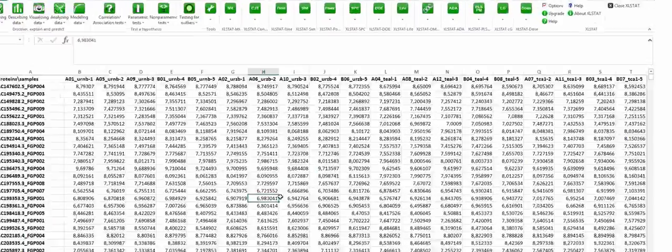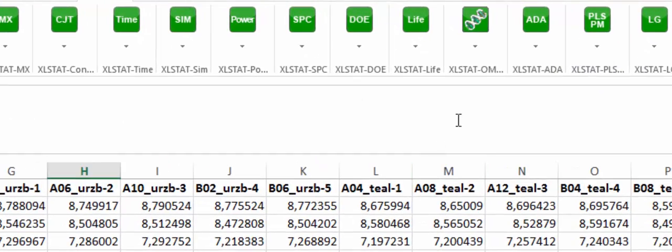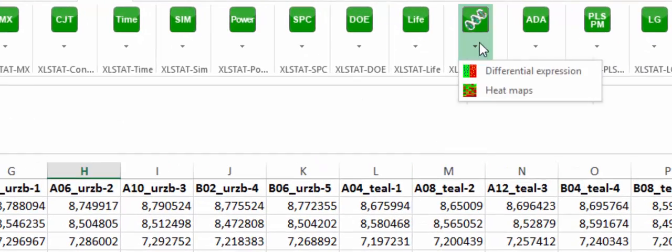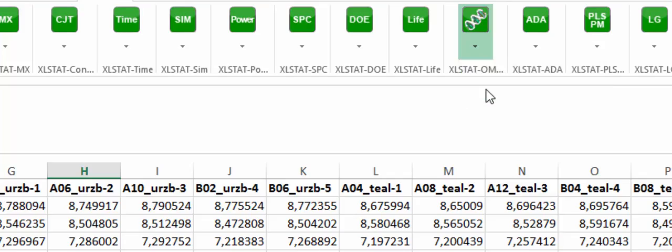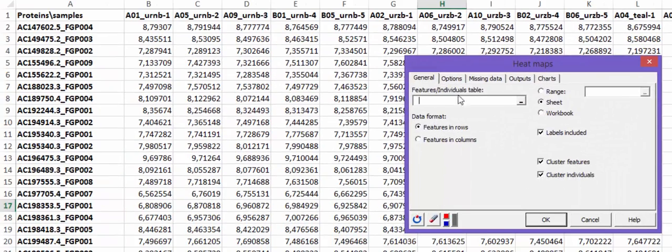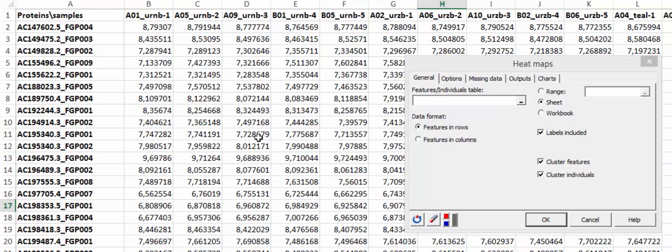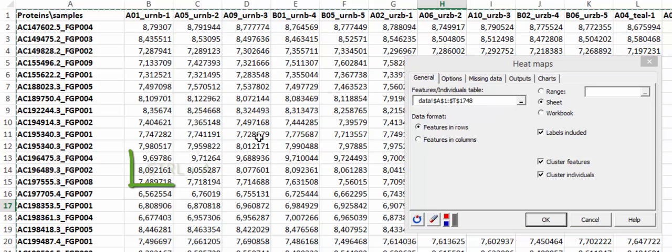And here we go! Go to the XLSTAT omics menu and select the Heatmap feature. Select the data in the Features Individuals field. To select the whole dataset, you just need to click on a random cell and press CTRL plus A.